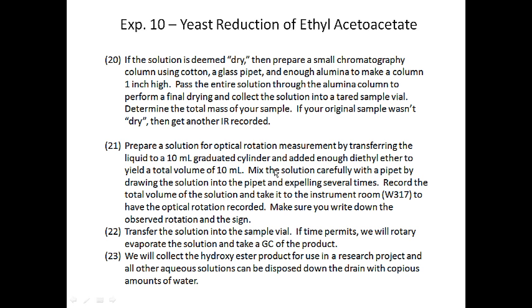And then you're going to mix that solution several times by simply taking a pipette, sticking it in your 10 milliliter graduated cylinder. You're then going to pull some of the solution up and then squirt it down, and pull it up and squirt it down. That will definitely mix the solution.